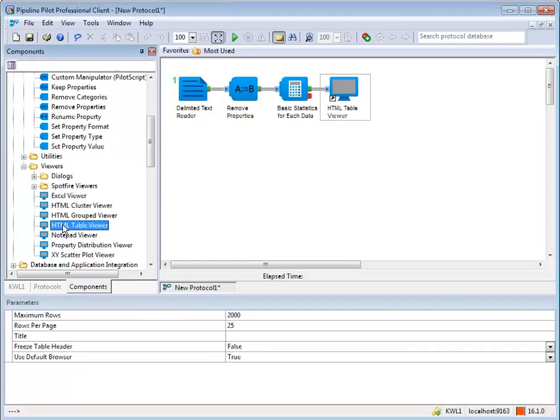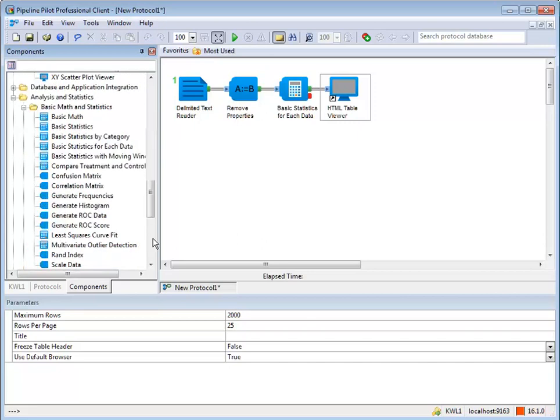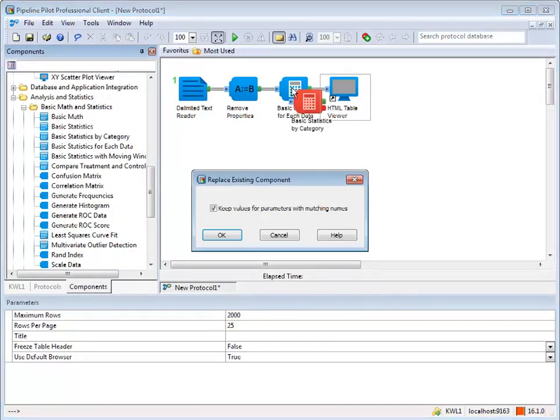Right-clicking on, then dragging a component over a component already in a protocol, enables you to replace a component in a protocol with another. You'll be prompted to confirm that you want to keep values for parameters with matching names.